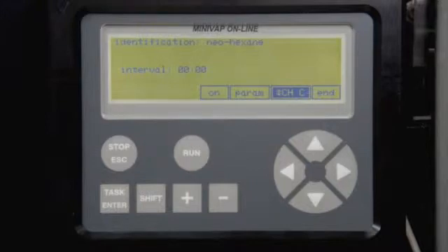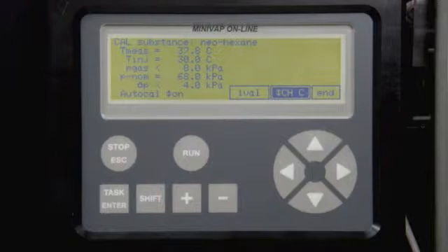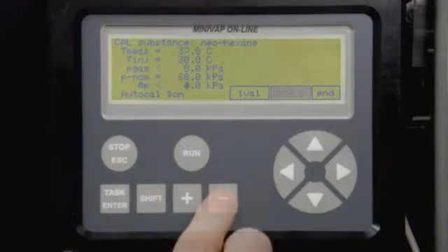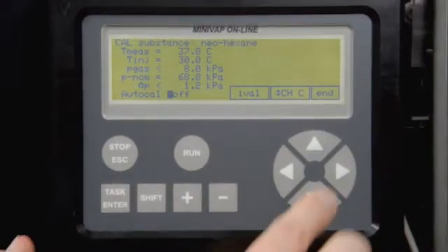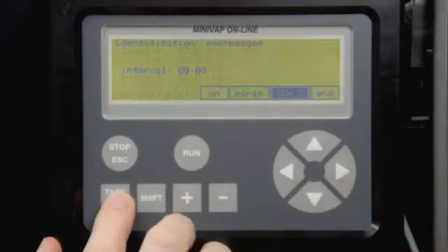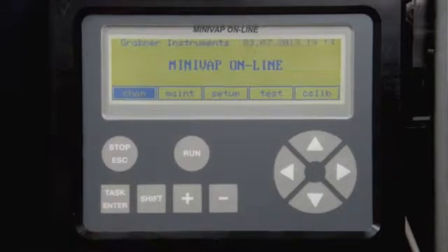Enter the name of the calibration standard and the nominal pressure of the calibration liquid. Delta P is the maximum deviation allowed. If this deviation is exceeded, an error is triggered and the unit needs to be recalibrated. Auto-Cal should be on for automatic calibration correction. If the channel is used for validation, turn Auto-Cal off. Adapt the calibration or validation interval. Click on End to get back to the main channel menu. Now your unit is configured.